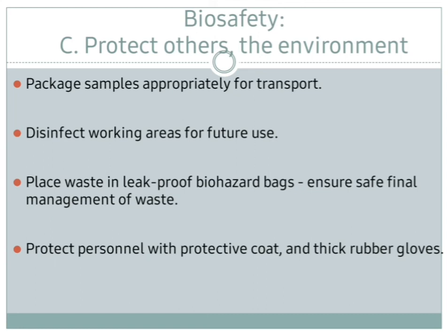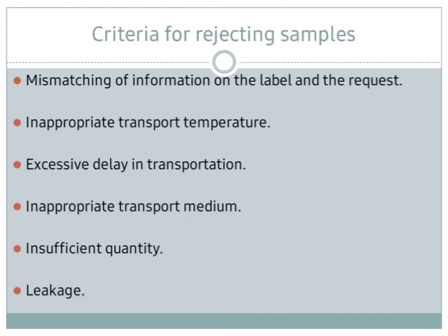We have to place the waste in leak-proof biohazard bags and ensure safe final management of this waste, and also protect the personnel with protective coat and thick rubber gloves. Therefore we must be careful in our work, and this is very important, to provide appropriate protection for ourselves, for the patient and for the environment.